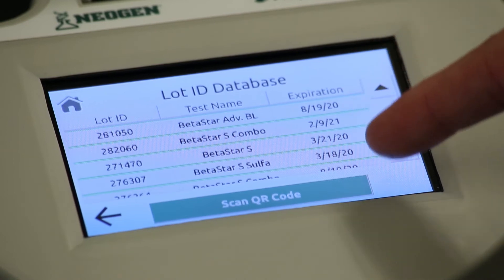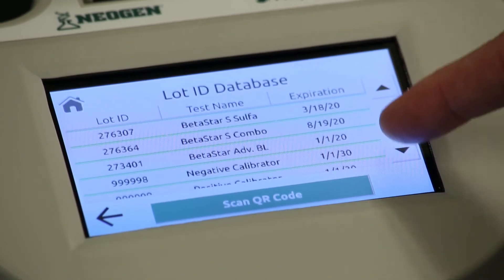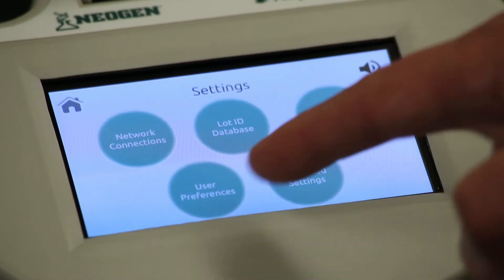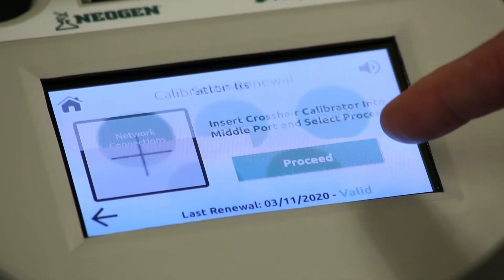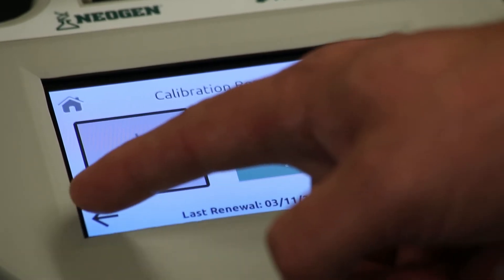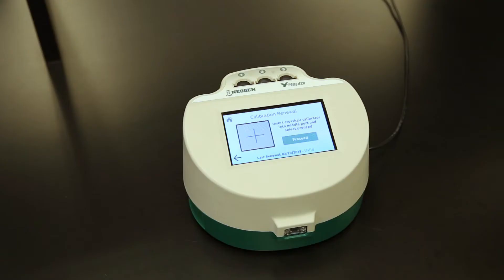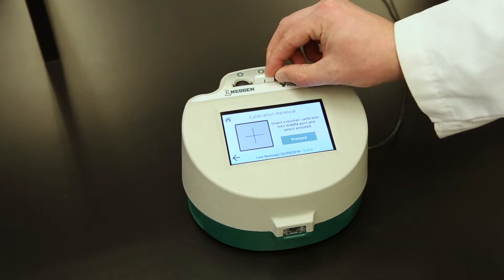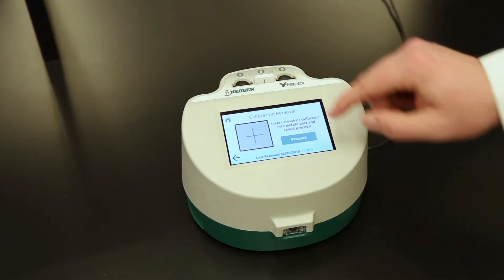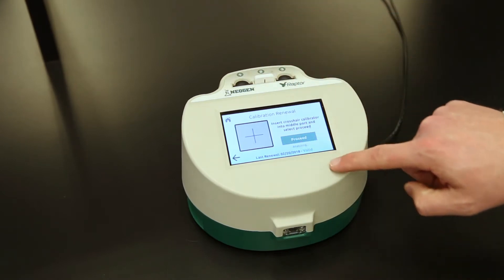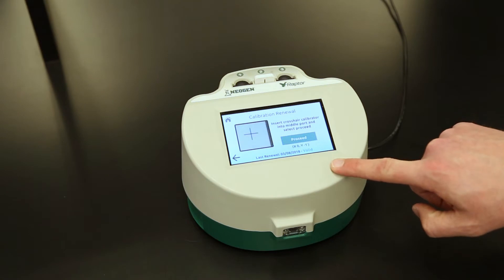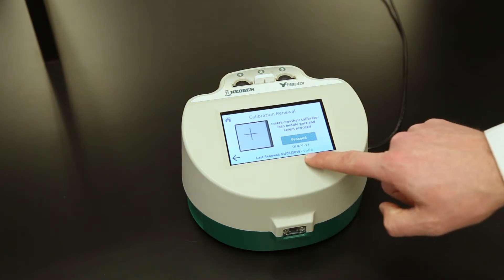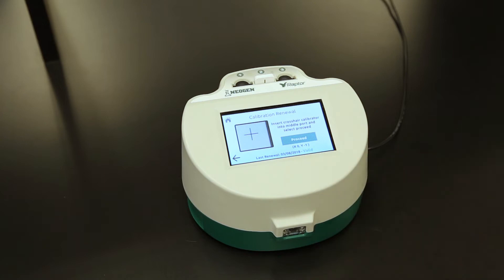Network connections and user preferences can be accessed directly from the home screen. The lot ID database is a record of all the test kit lots that have been added to the Raptor. Calibration renewal is performed once a year and takes only a few seconds. To calibrate, insert the included calibration device into the middle port and press proceed. The calibration will be updated and the current date will be added to the last renewal section.